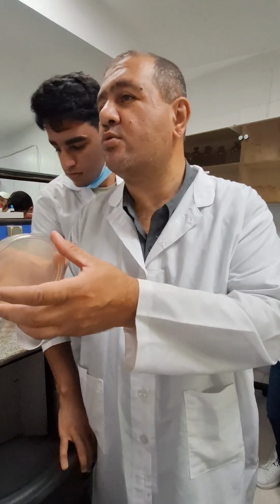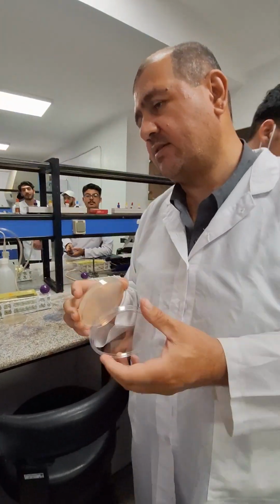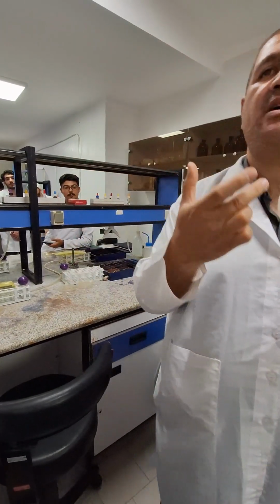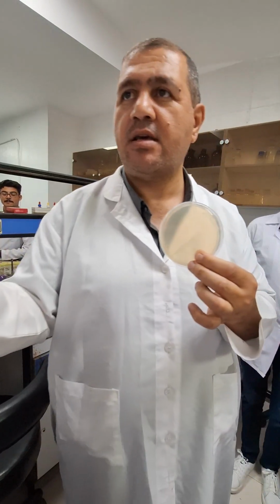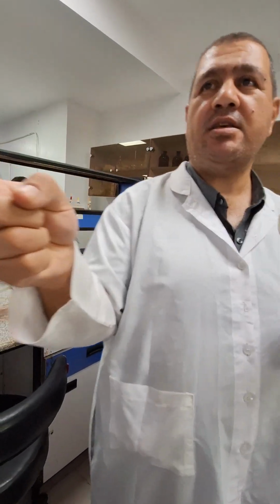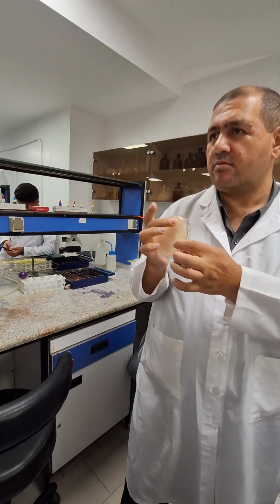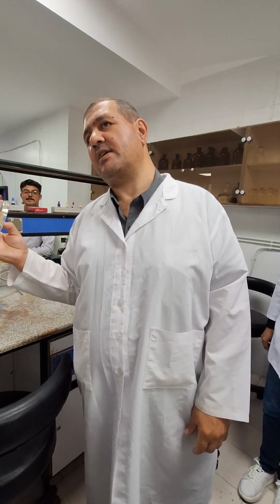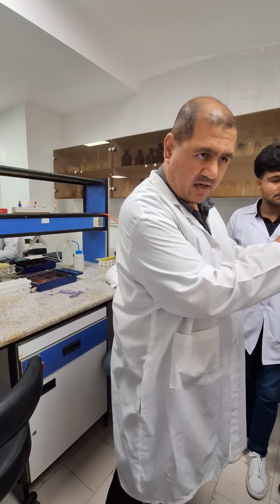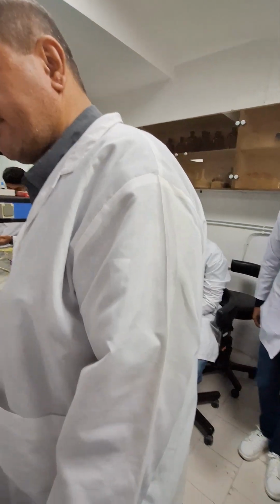The plate contains two sections, two parts: the back of the plate, and the lid or cover of the plate. For labeling, we use the back of the plate. In the labeling, you must write your name, your lab ID, and the name of the medium, nutrient agar. For labeling, use the edge of the back of the plate, not the center of the plate. Okay? Take the CD marker and label.